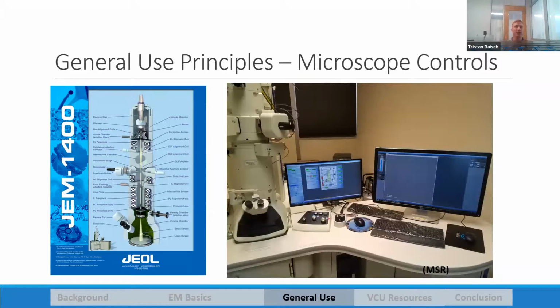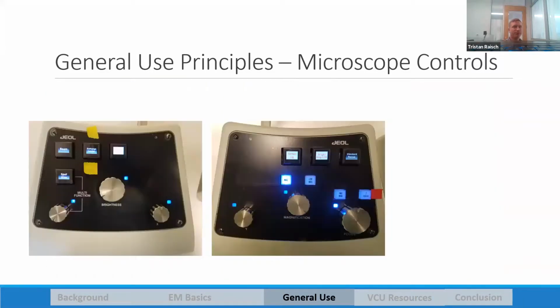Once the sample is prepped, it's time to actually put it in the microscope. The first time you walk into an EM room, it's probably pretty intimidating, as there are all these knobs along the column. There's a loud pump to pull the vacuum, but it's really a straightforward process. The only part you'll even be touching on the column as a novice user is the sample holder. Now, this is an absolutely critical piece of equipment, as this is where you'll be interacting with the vacuum chamber. So just remember to be extremely careful, follow the facility's protocols exactly, and you'll avoid damaging the microscope.